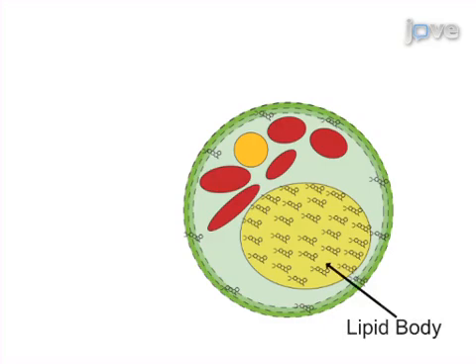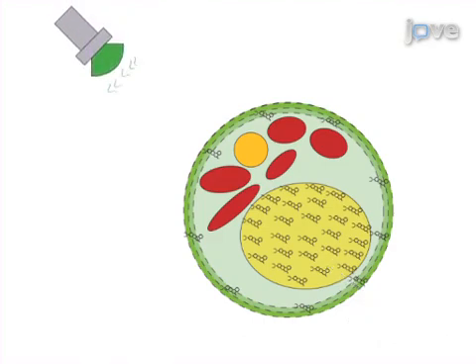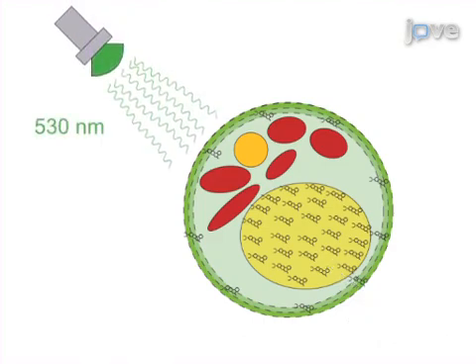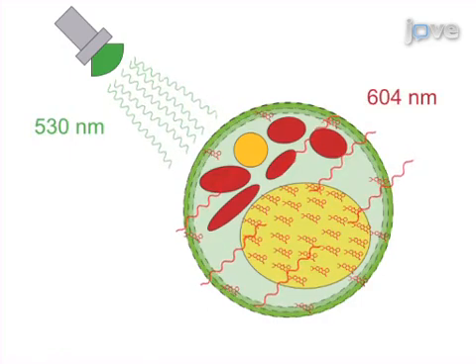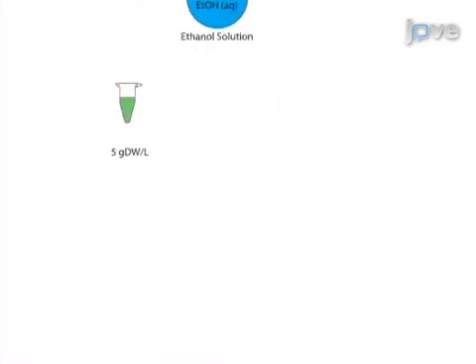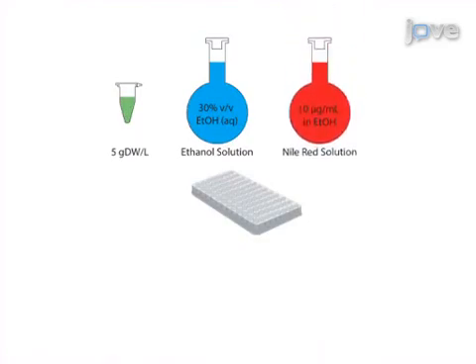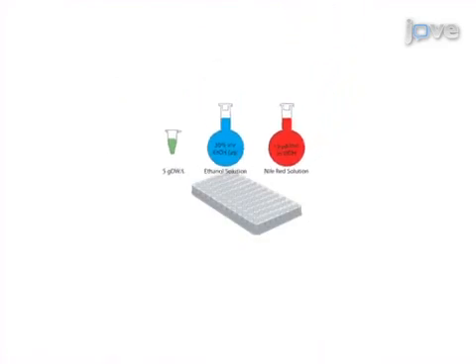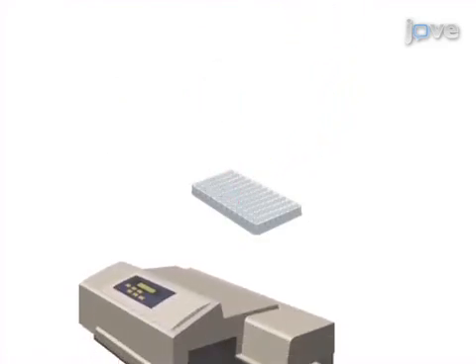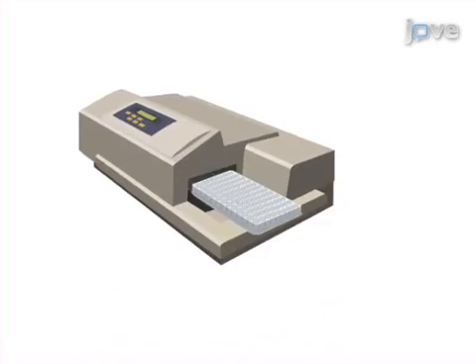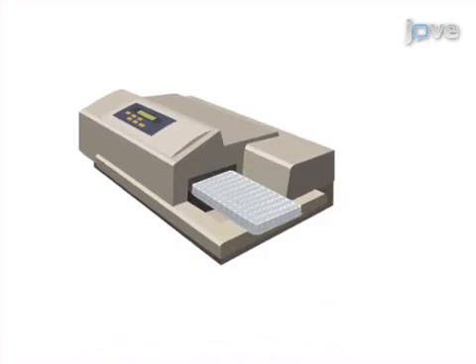Next, the samples are exposed to an excitation light source of 530 nanometers, causing the Nile Red absorbed in the neutral lipid bodies to fluoresce at 604 nanometers. Results are obtained on a mass scale by conducting the individual tests in a microwell multiplate and using a spectrophotometer to produce rapid fluorescence readings.